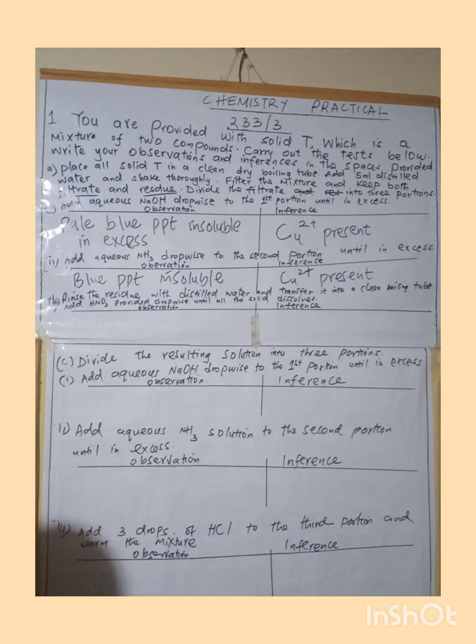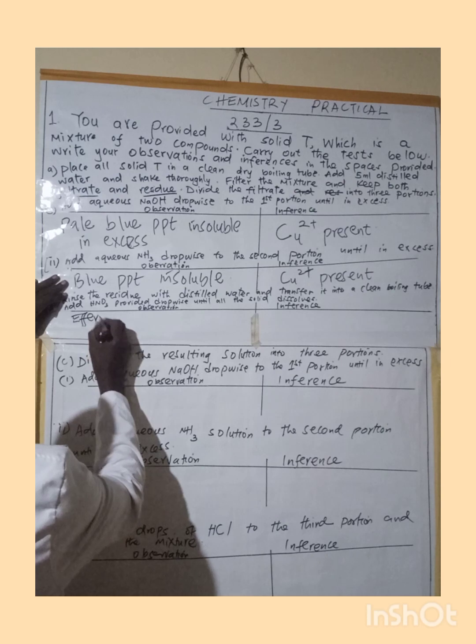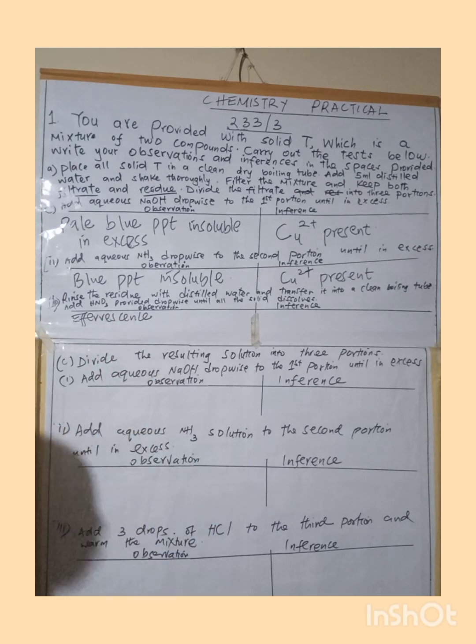Now, the observation which was made here is that number 1, effervescence was observed, or we will say bubbles of a colorless gas was produced.